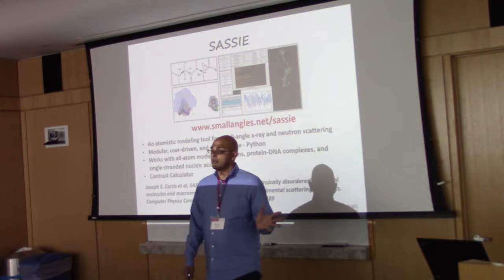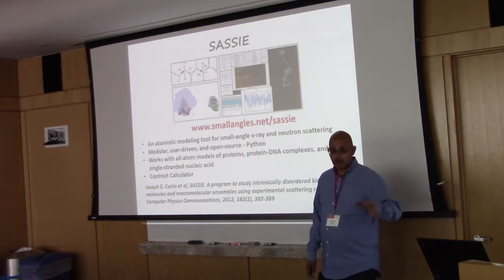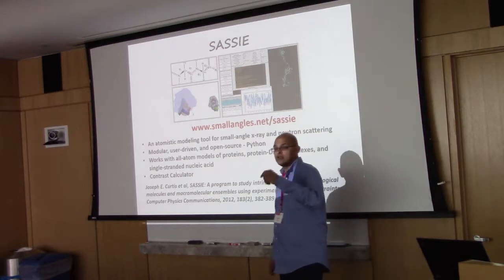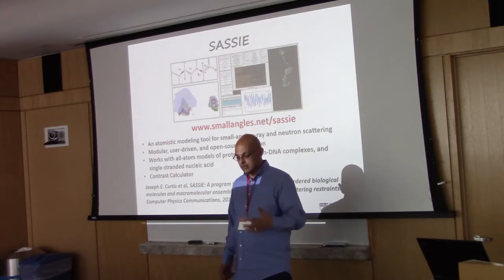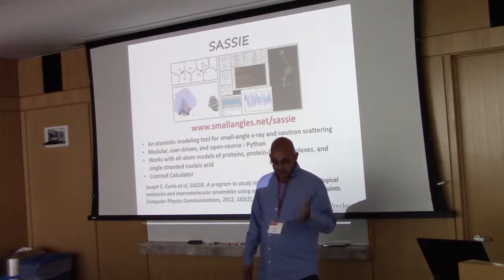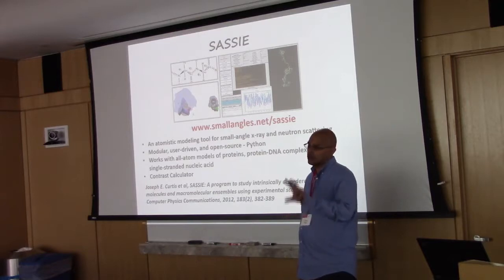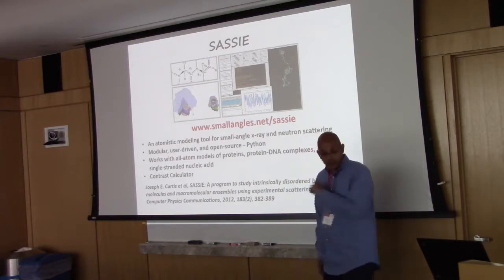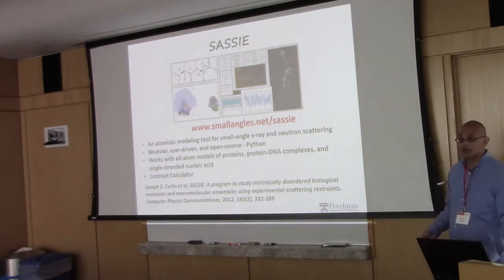program that has a lot of computing power behind it, a ridiculous amount of computing power, very powerful, all right? Unlike some programs that are constrained with regards to the number of units you can have, protein versus DNA, and the type of sampling you do, SASSIE is very powerful in that it uses molecular dynamics conventions to allow you to do a lot of different types of complex systems, including carbohydrates if you want, lipids if you want. Now it works with protein and DNA specifically with regards to conformational sampling, protein and nucleic acid. It has developed quite a bit since then, but I highly suggest this program if you're interested. It's a really rigorous approach, and it also helps you with neutrons as well, in contrast.